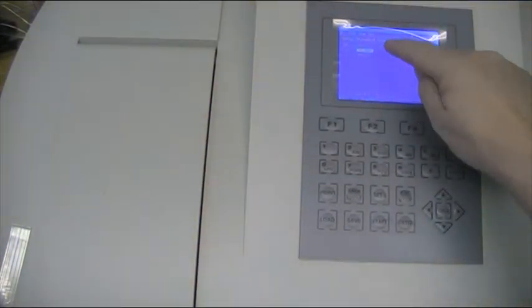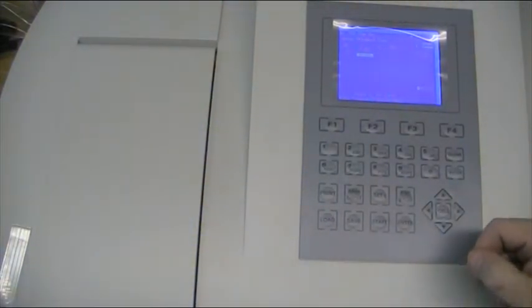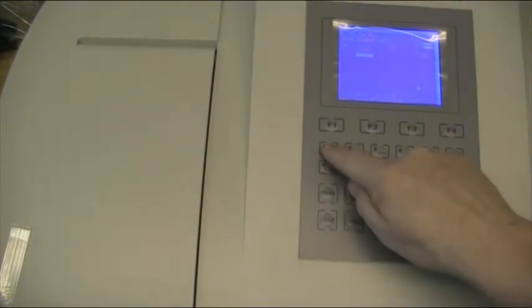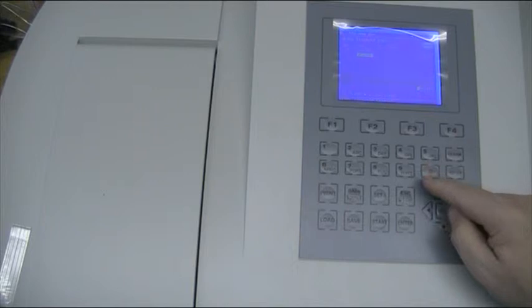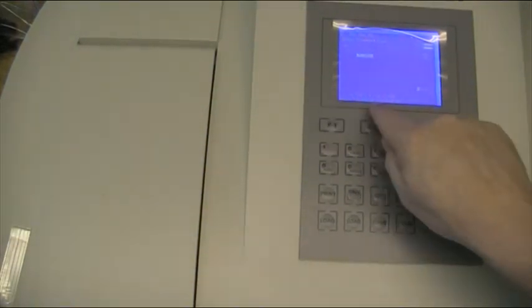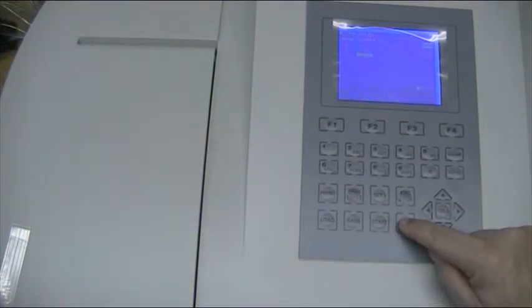The first standard that we're going to put would be a blank, so that would be 0, so that's fine. The next one that we will use for this test, and I'll calibrate it using 2 standards, would be, for example, let's say 10.00%, so it says input standard curve 10, and then on the display is 10.